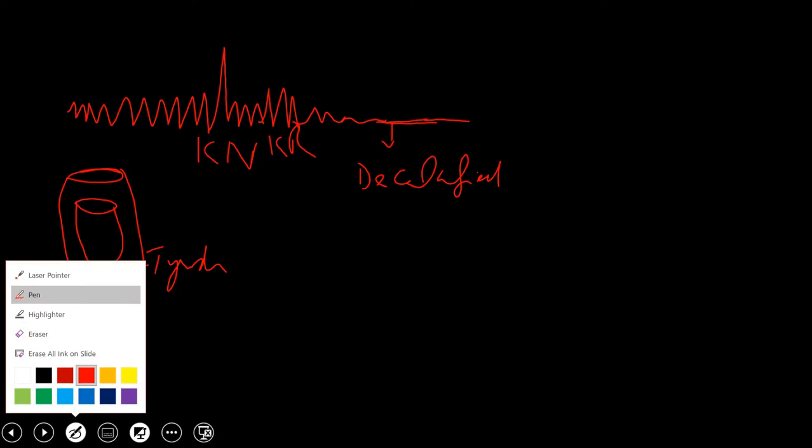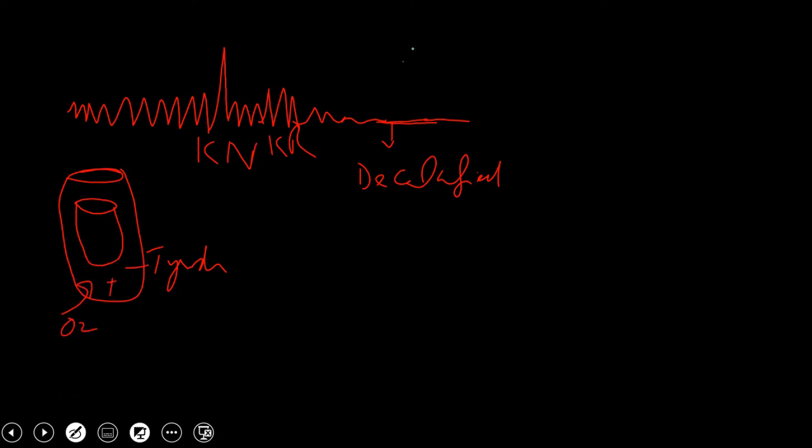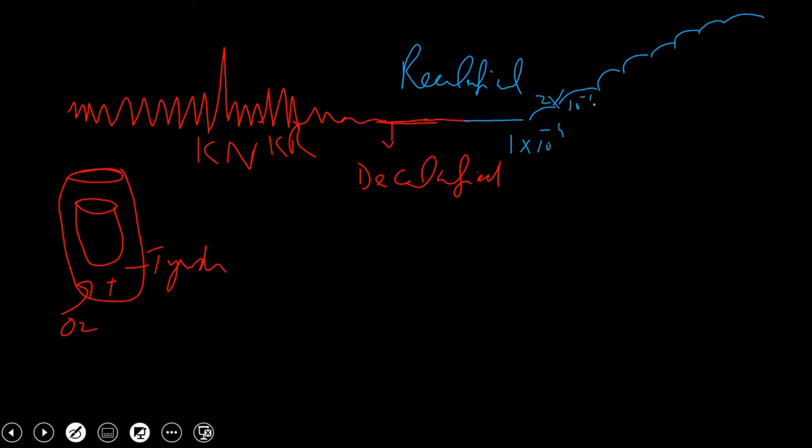It has to be what you can say, if I write it for here, recalcification. Now we will do recalcification. If we are going to do recalcification, this will be with a standard known concentration. For example, 1 into 10 raised to the power minus 4 molar, then 2 into 10 raised to the power minus 4 molar, then 8 into 10 raised to the power minus 4 molar, until on you multiply this double.